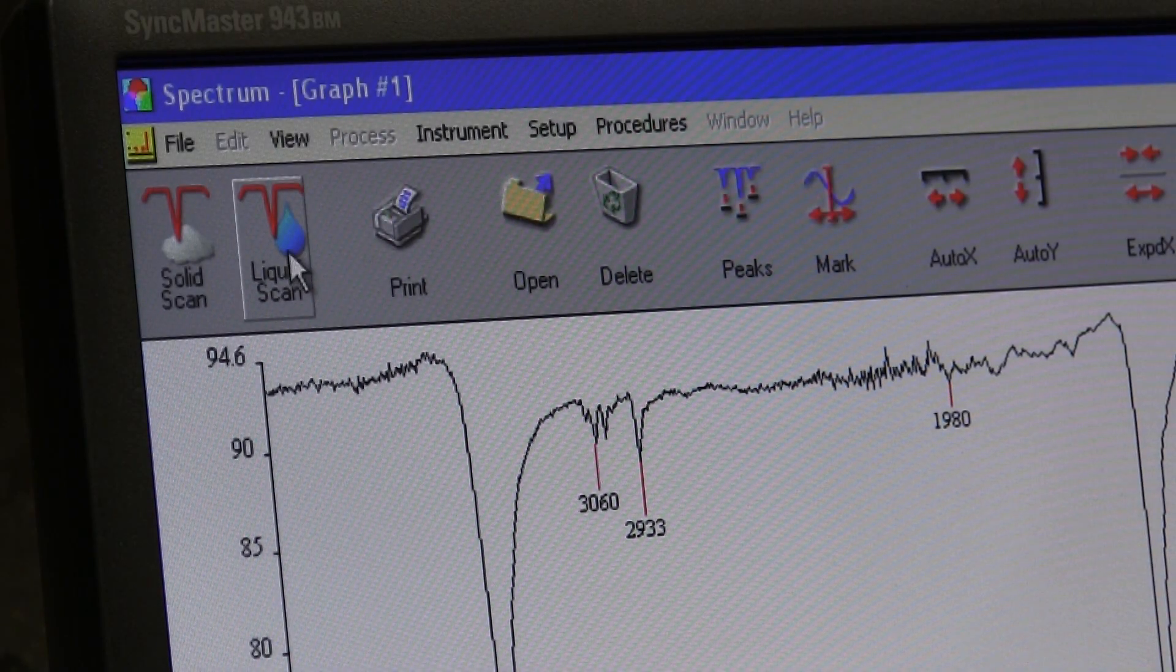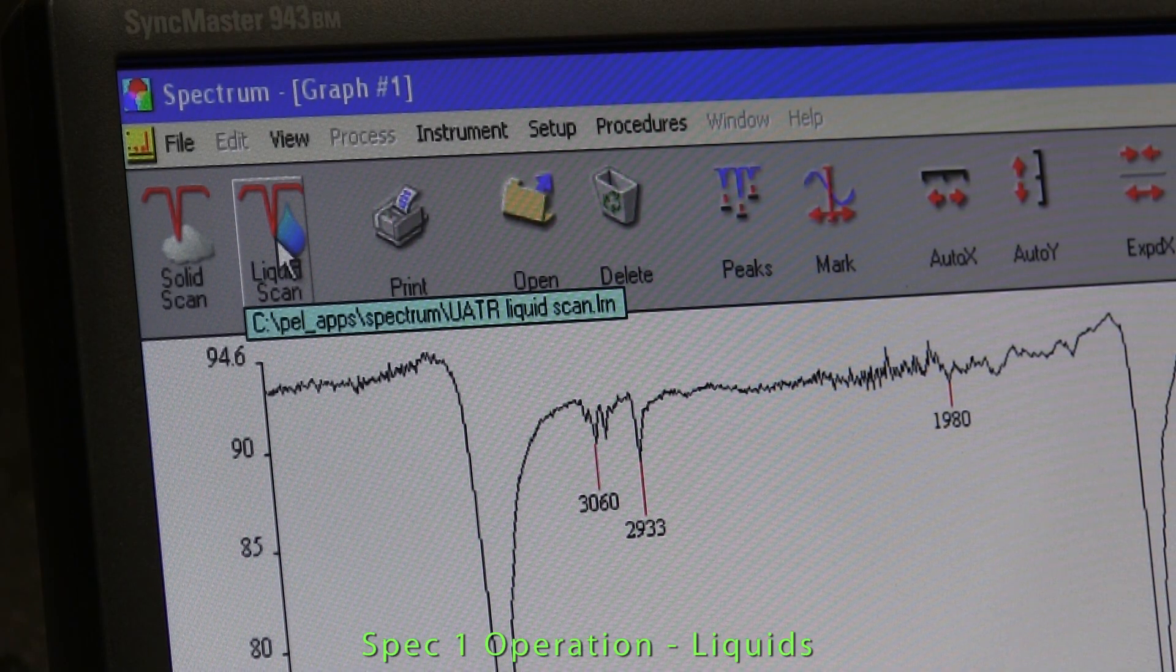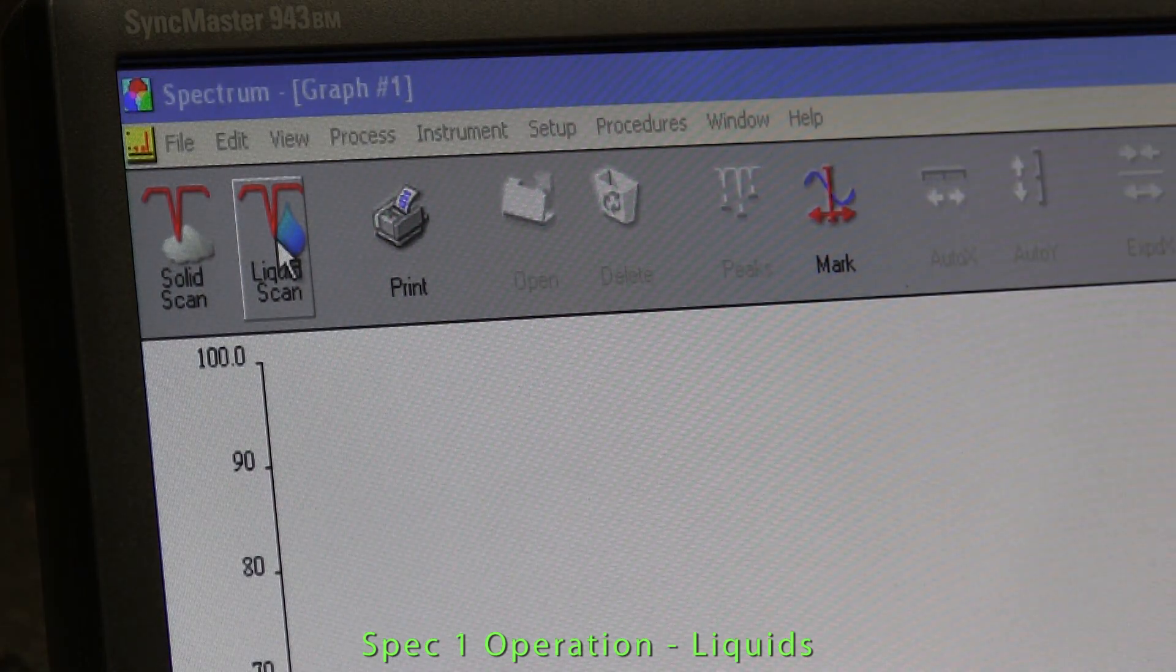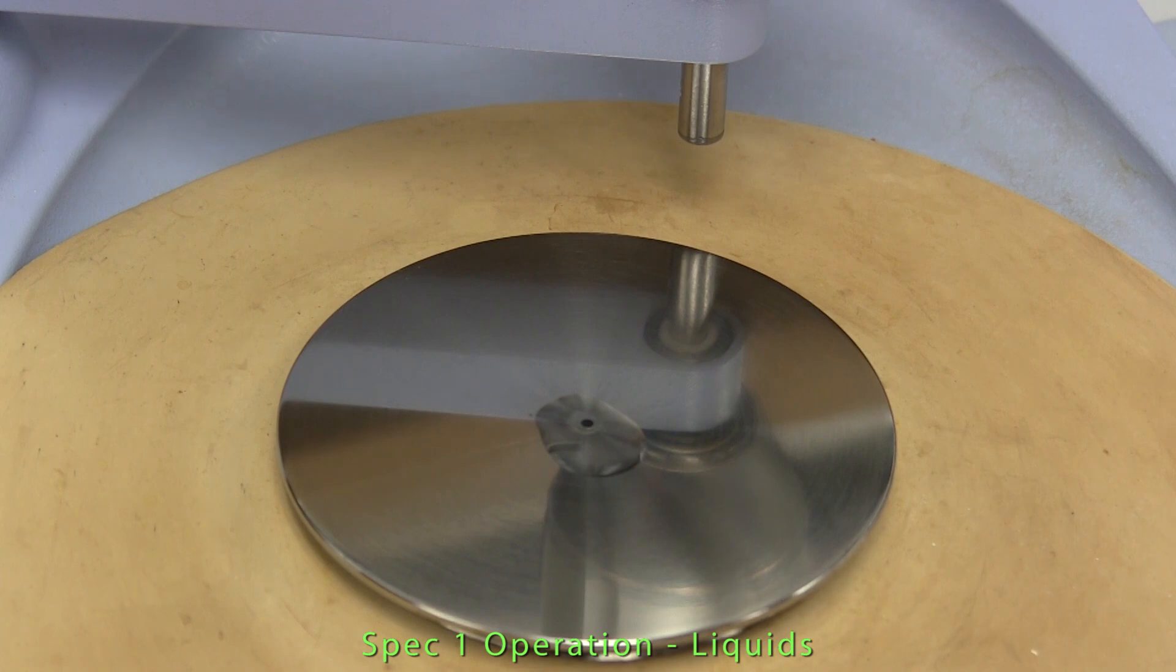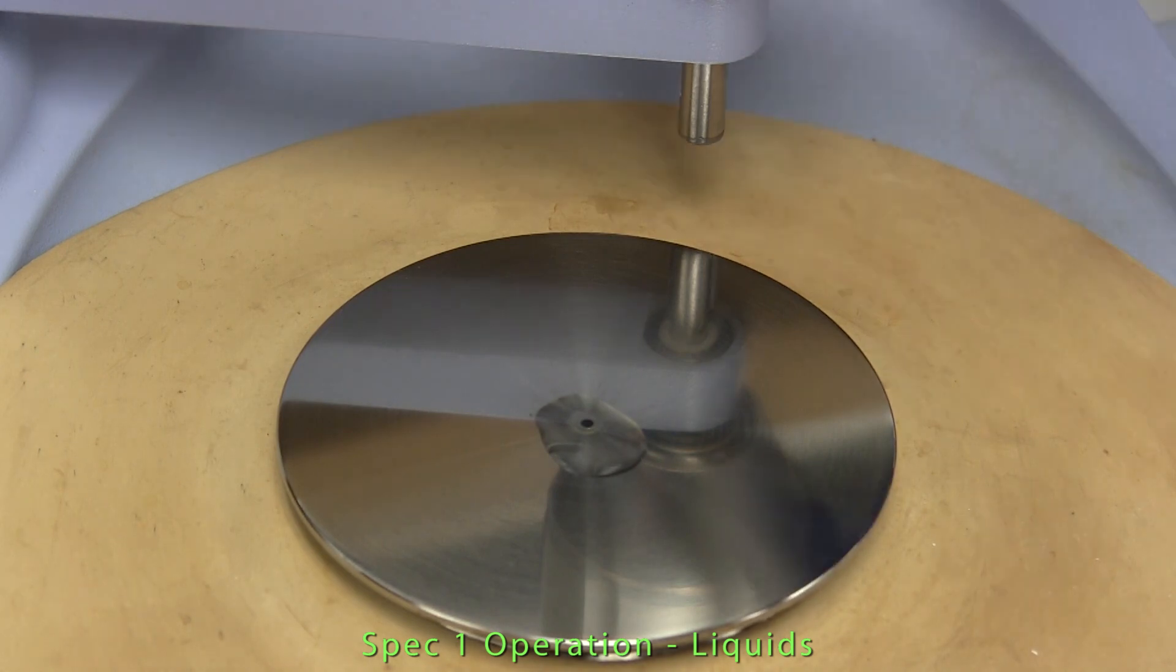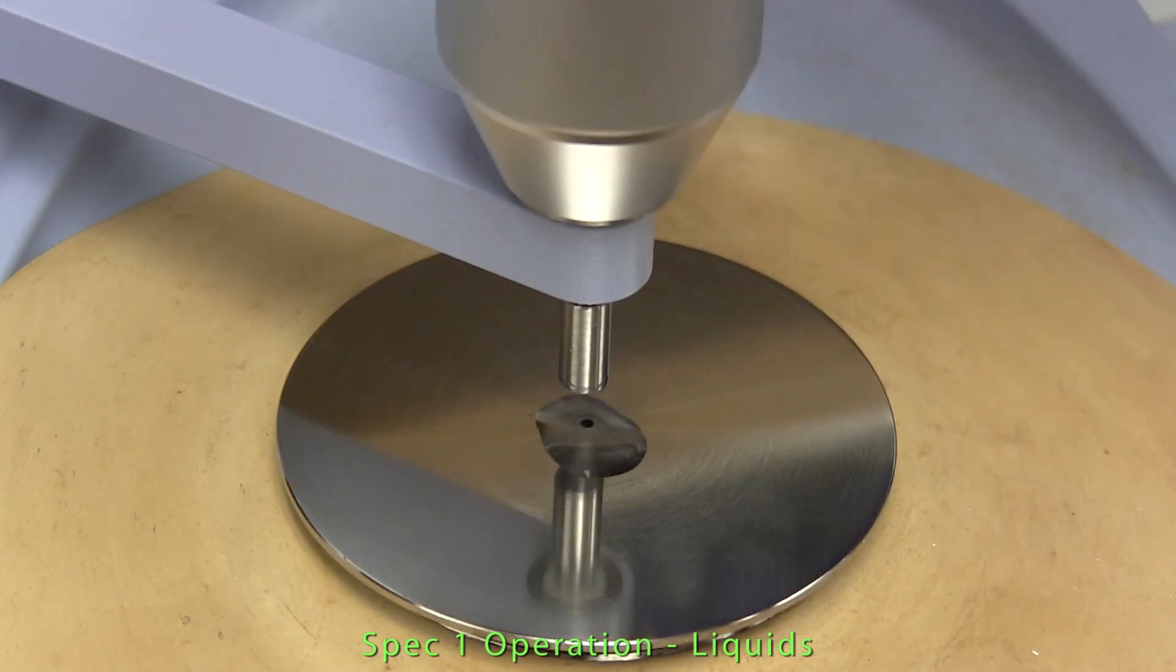Scanning a liquid sample with the ATR is very much the same as a solid. First press the liquid scan icon. A few drops of liquid are then placed over the ATR crystal and the pressure arm is rotated so that it just touches the sample.